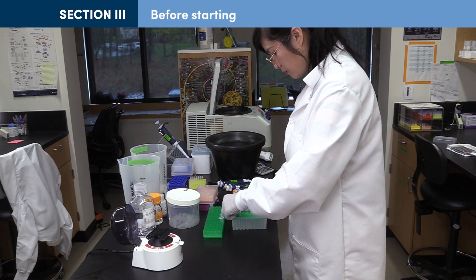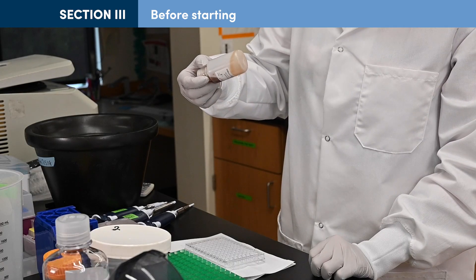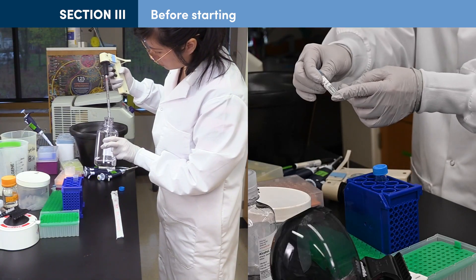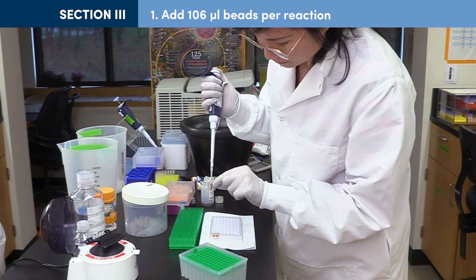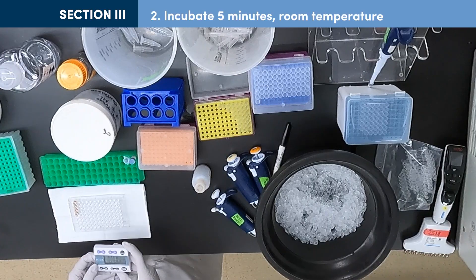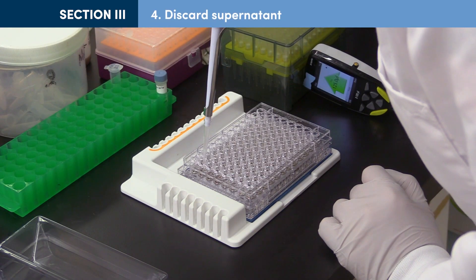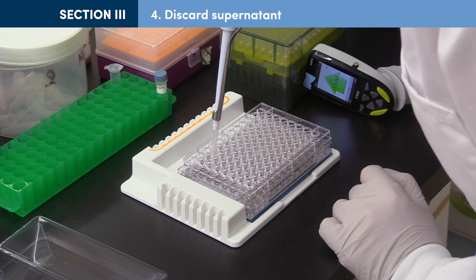Thaw ligated DNA samples if they were stored in the freezer, and prepare Ampure or Sera-pure beads by inverting or swirling the bottle, aliquoting the volume of beads needed, and allowing them to warm up to room temperature for 30 minutes prior to starting. Prepare fresh 80% ethanol and tris chloride. Add 106 µL of beads to each adapter ligation reaction. Mix thoroughly by pipetting up and down 10 times or more. Incubate the beads at room temperature for 5 minutes or longer, then place tubes on a magnetic stand for 5 minutes. Carefully remove and discard the supernatant, removing as much liquid as possible but without disturbing the pellet. This helps to eliminate free adapter.